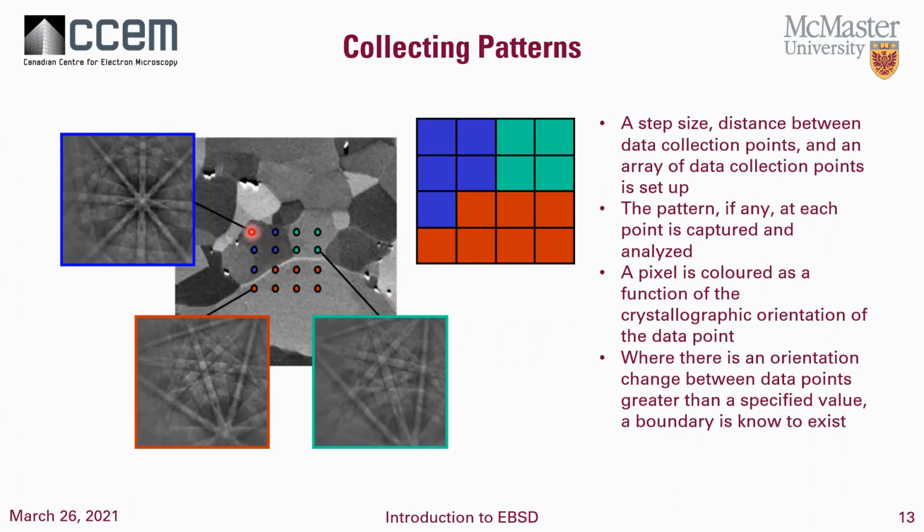For each data point, we'll have a pixel to represent the information that's captured, and we'll color it based on crystallographic orientation.